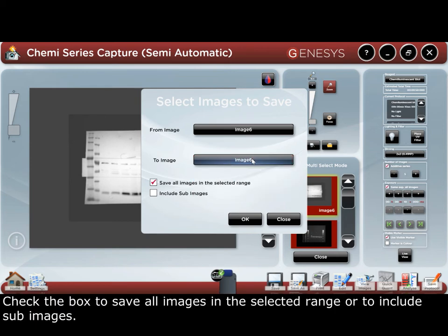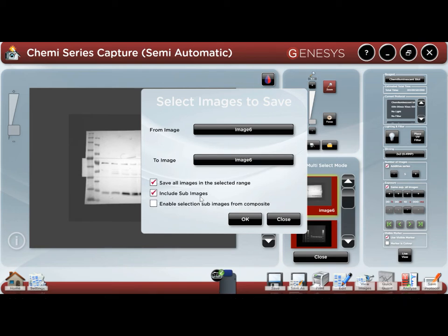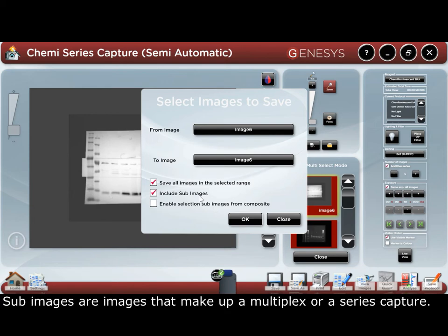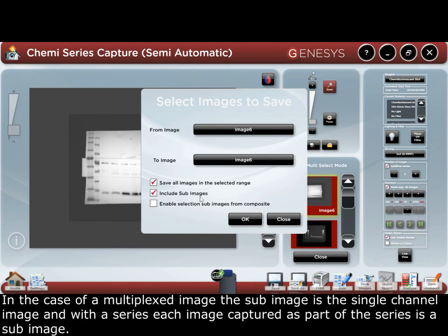Check the box to save all images in the selected range or to include sub-images. Sub-images are images that make up a multiplex or series capture. In the case of a multiplex image, the sub-image is a single channel image, and with a series, each image captured as part of the series is a sub-image.